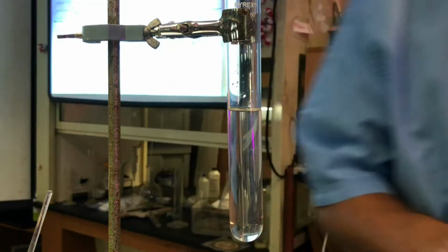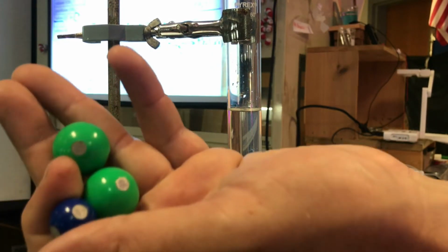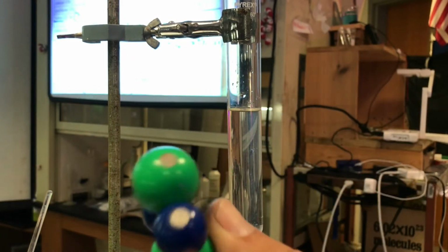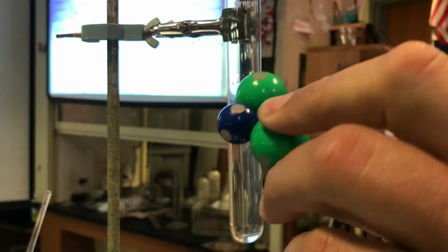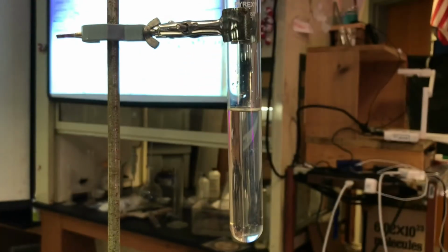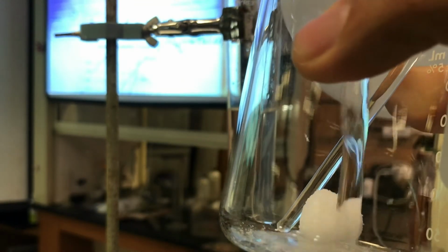So you've got these free ions, and of course they stick together in water, because water can't compete with those charges, and they make a crystal. So, back to reality here. I've got my KI. We just said it was soluble for two reasons: group 1 ions, and what else? Halides are soluble. So pour this in.